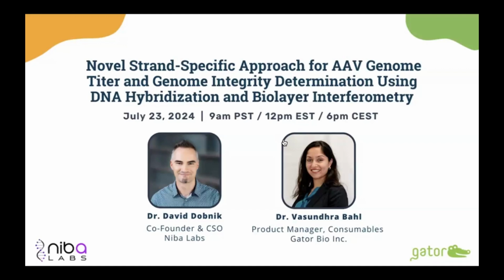However, as said in the end, we would prefer to go into a more controlled format, perhaps like plasmid DNA or even synthetic DNA, especially for the strand-specific way of quantifying, because with AAVs, we are actually not certain what's the amount of each of the strands that are there.